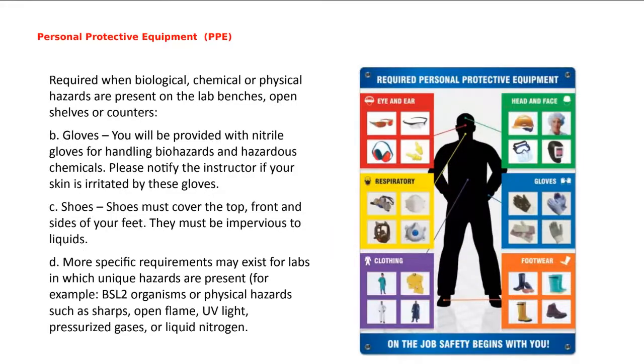Other things you'll need to wear is you'll need to wear gloves anytime we're working in the lab.